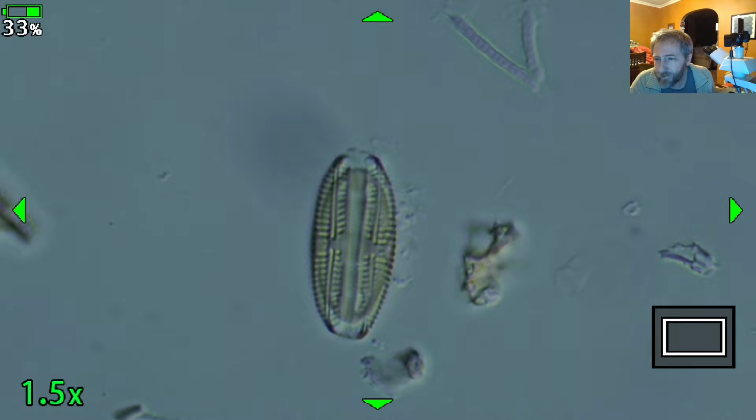What's the question that I missed from... they have you on your stream all the time. Oh, dinoflagellates, yeah. Dinoflagellates sometimes eat the diatoms, right?